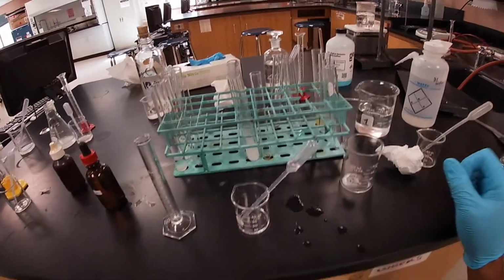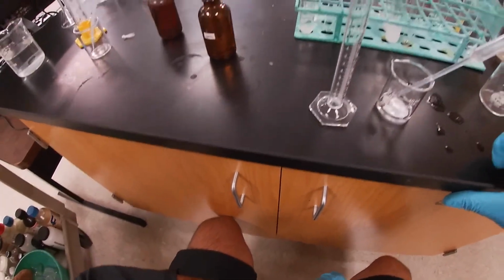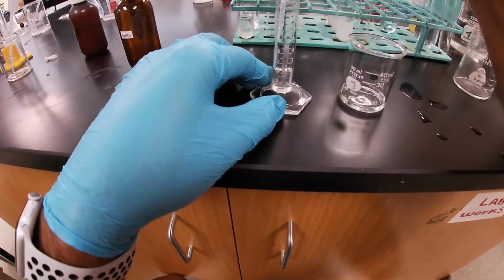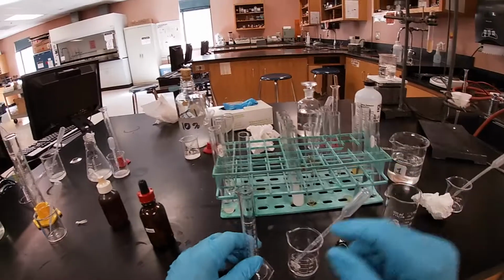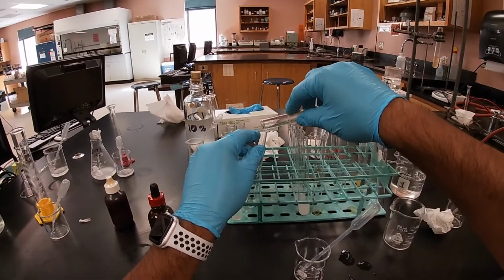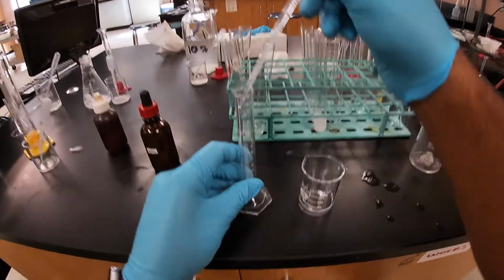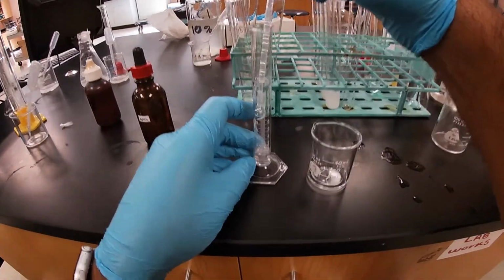So let's go ahead and do our measurements of our 2 milliliter content. All right, so now we're gonna measure our 2 milliliters and place into our test tubes. And so that's 2 milliliters of our filtrate. We're gonna add to our first test tube, and then we're gonna go through all the tests again. Hopefully we have enough for all three.